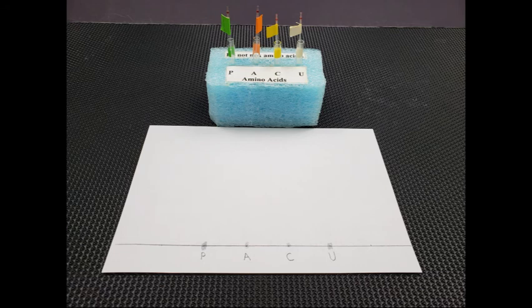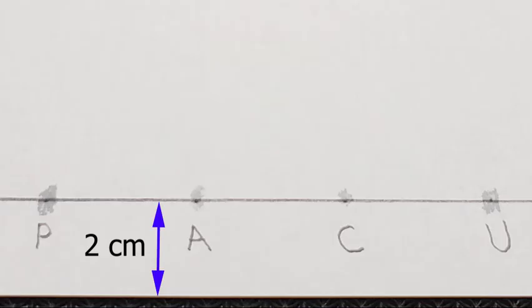Procedure: obtain a sheet of chromatography paper by holding it at the edges. Be sure to minimize the formation of fingerprints on the paper. Remember that you leave some of your proteins behind when you leave a fingerprint. You must not use a pen on the chromatography paper.